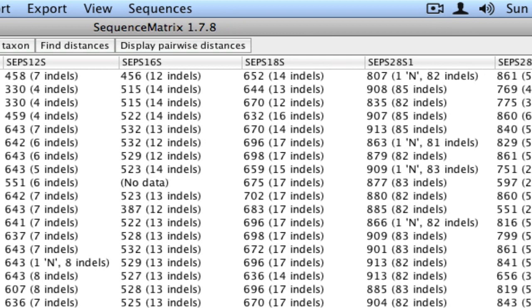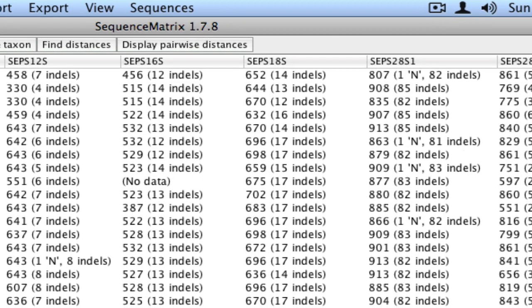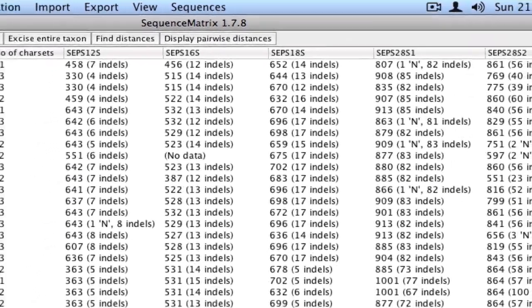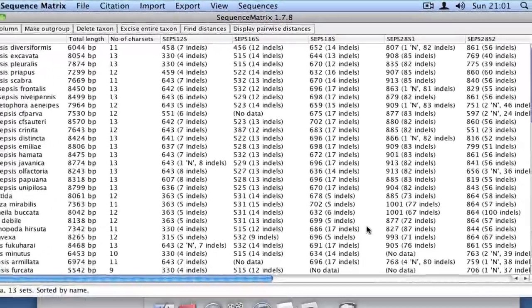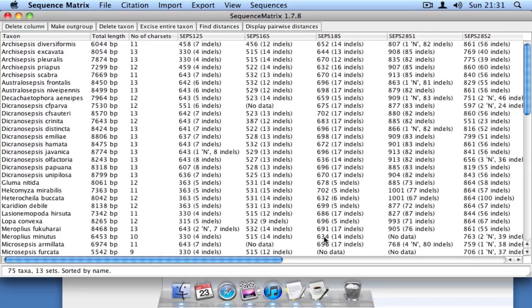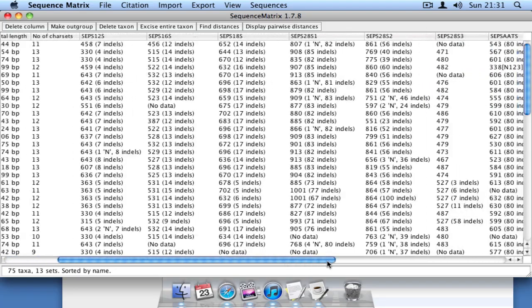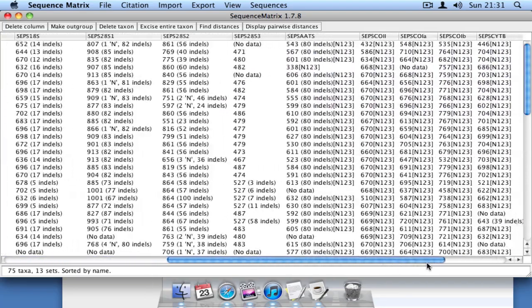This latter piece of information can be very useful because it allows you to detect quickly if there are sequences that have indels but shouldn't, like mitochondrial genes.